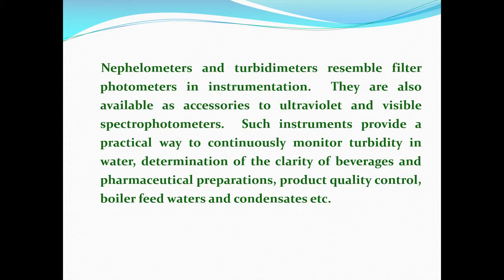As far as instrumentation is concerned, I have already explained that turbidimeters and nephelometers resemble filter photometers in instrumentation. They are also available as accessories to our ultraviolet and visible spectrophotometer. Such instruments provide a practical way to continuously monitor turbidity, just like FIA, flow injection analysis, in water, and the clarity of beverages such as Coca-Cola, Fanta and all these drinks can be quality controlled using turbidimetry.